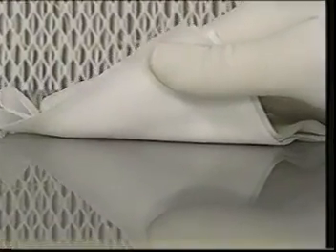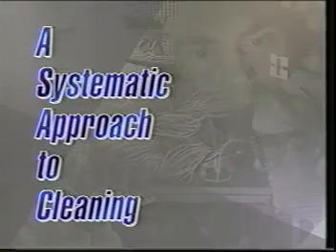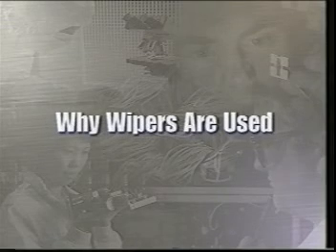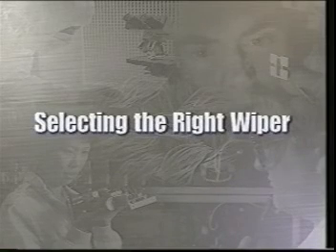Over the next few minutes, we'll show you how to achieve the best results using a wiper by taking a systematic approach to cleaning. In other words, we'll look briefly into the necessity for using wipers, how to wipe for greatest efficiency, and how to select the wipers best suited to your work and cleanroom environment.